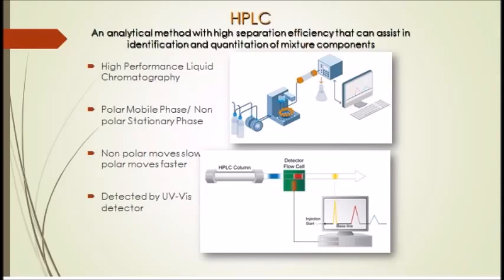Now, while working on synthesis, I have also started developing a method using high-performance liquid chromatography for separating the components of a reaction mixture, whether this mixture is from synthesis or degradation studies. This method will assist me in identifying and quantifying the separated components.